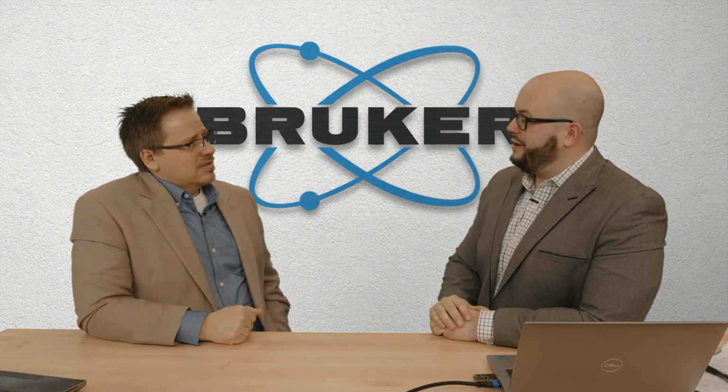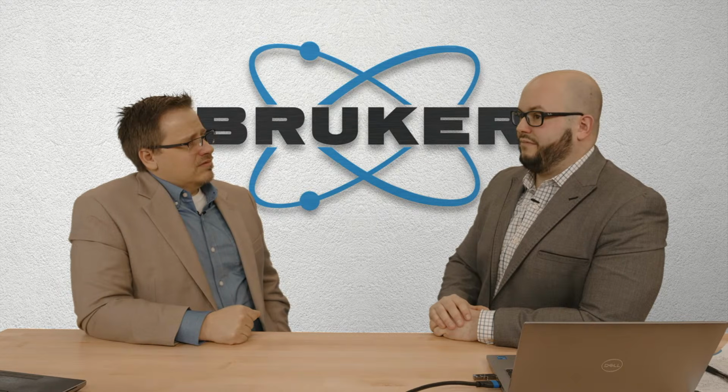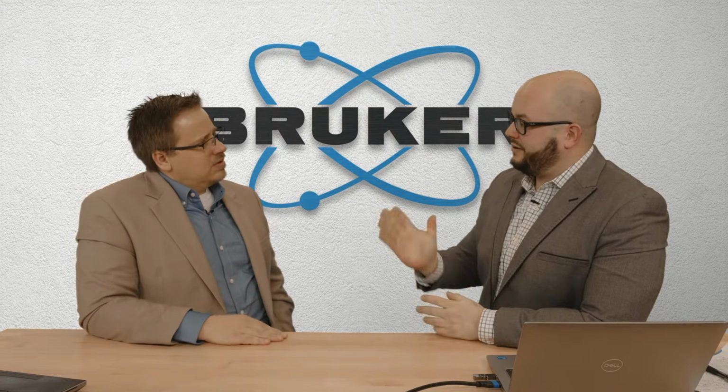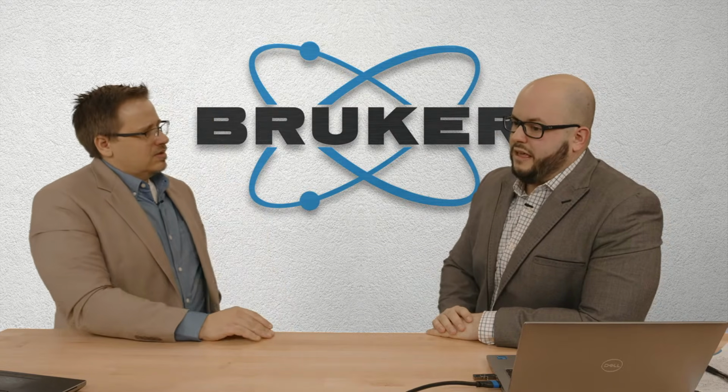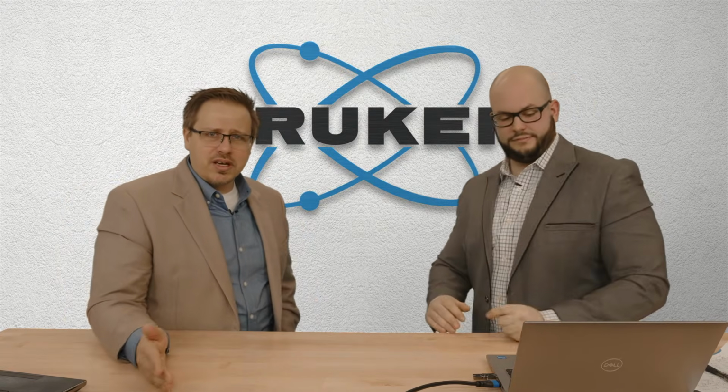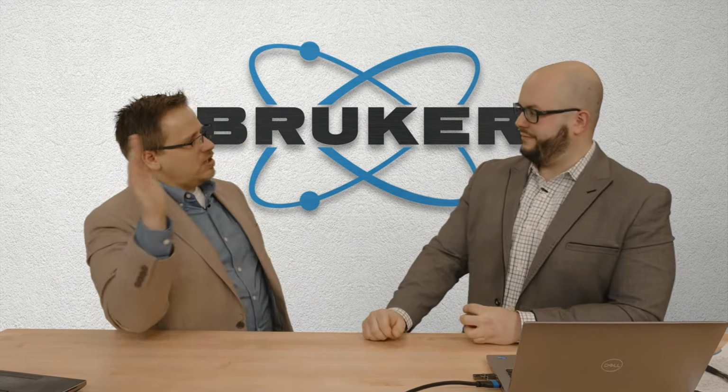You would probably want to use a grazing incidence approach. As you start to get down to those nanometer level measurements, like we talked about before, GID, multi-HKL approach. I measure the GID in the software. Check out the tutorial. There's a great example of it, multi-HKL.